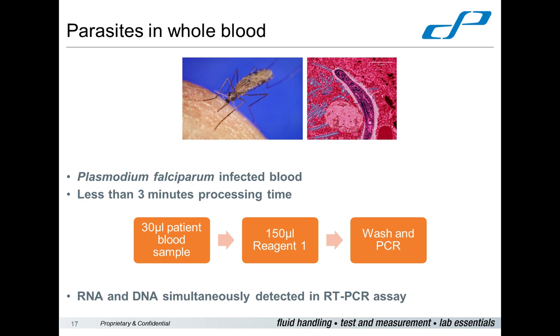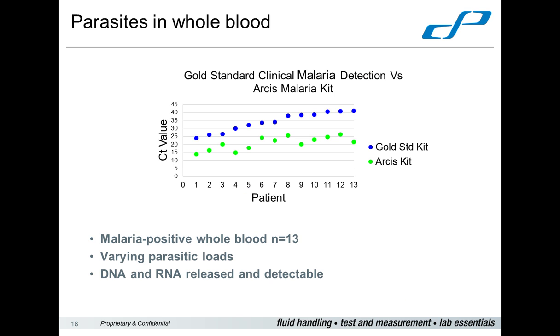So by the primer design, we were actually able to detect both populations of biomolecules. And the effect of this, as the next slide will show you, was a massive boost in sensitivity.